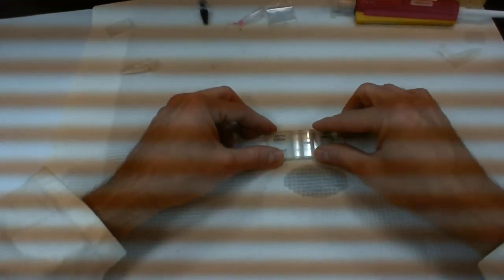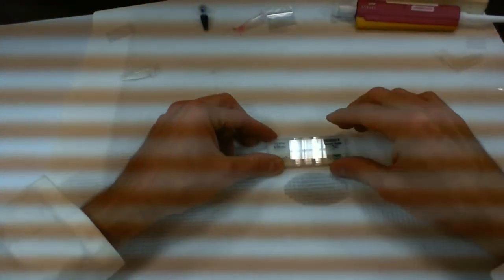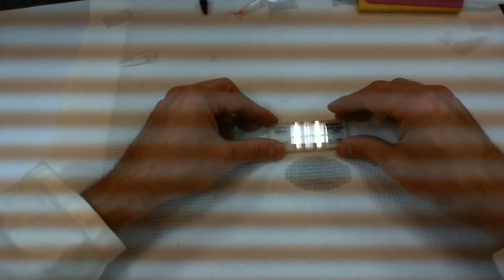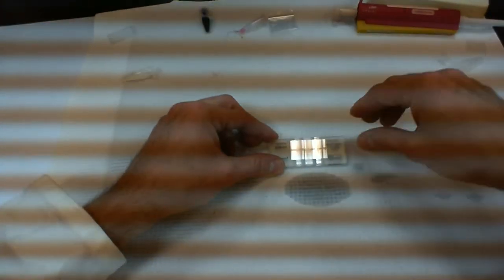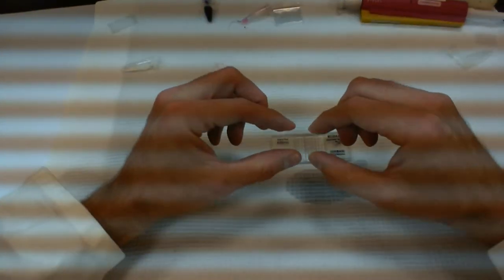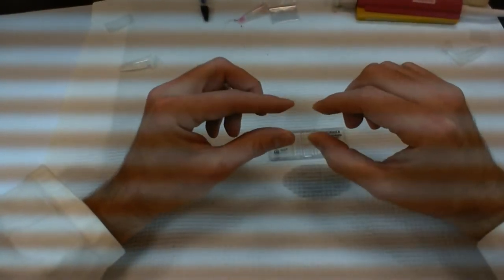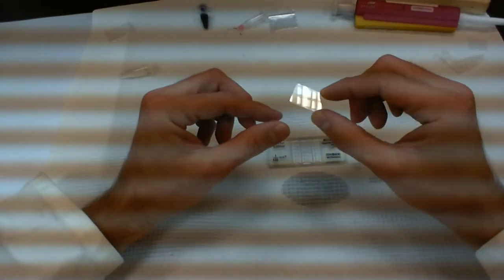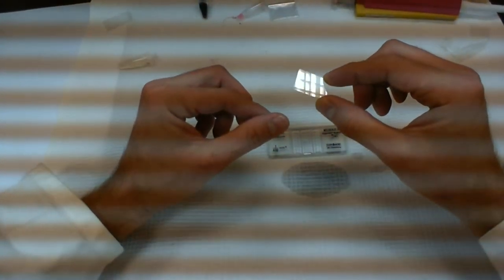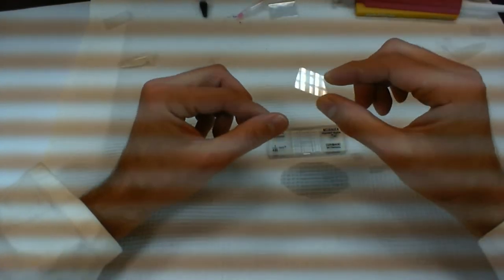So all you do is just put your cover slip on like this. And by the way, this is just a regular cover slip. We found that undergraduates are not very careful with their tools, and so these hemocytometers initially come with a thicker cover slip, which you can't really see here. Can't really see the thickness, but this is about 3 to 4 times as thick as a regular cover slip. So they're pretty tough.